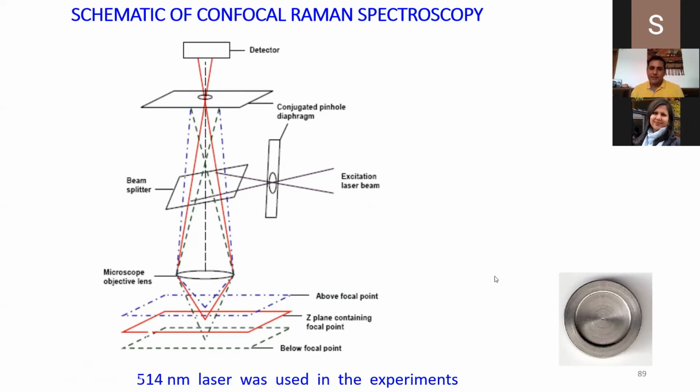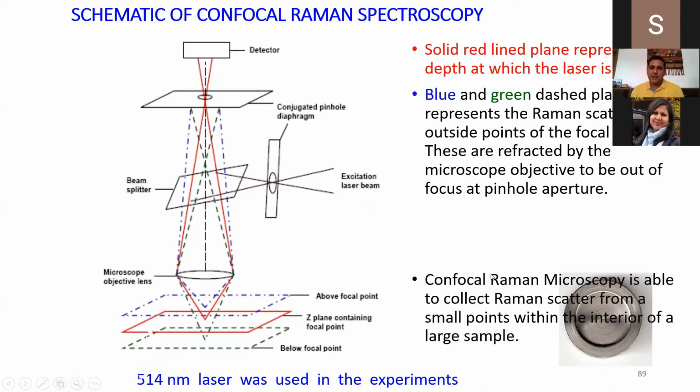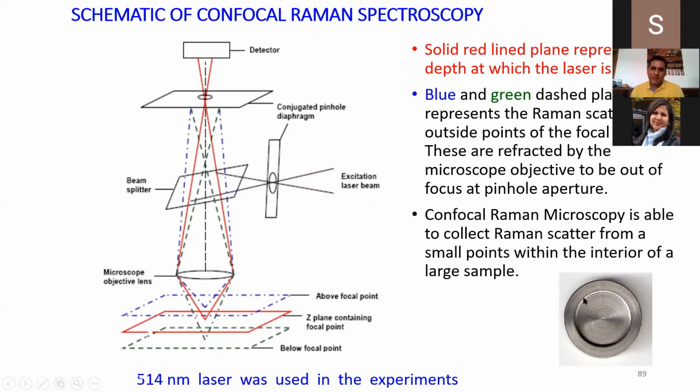Now you can see this metallic picture here. This is my case in case you have liquid samples or a polymer sample which you want to dry. You can pour the sample here, and this complete sample holder can be put on this red plane to locate it.